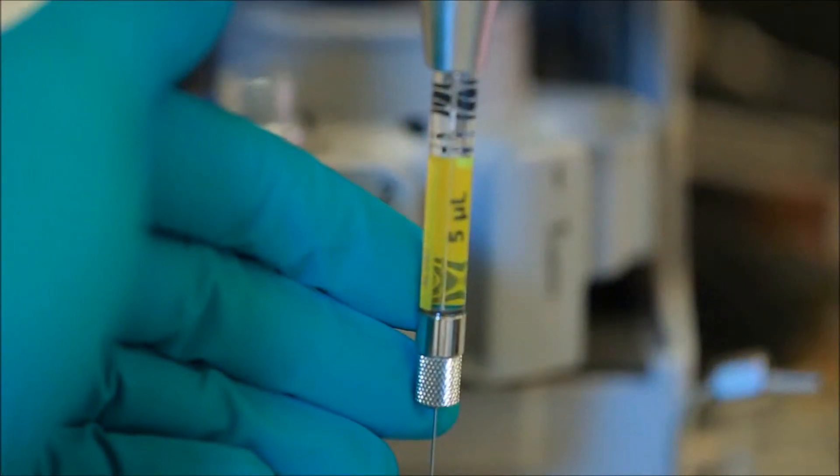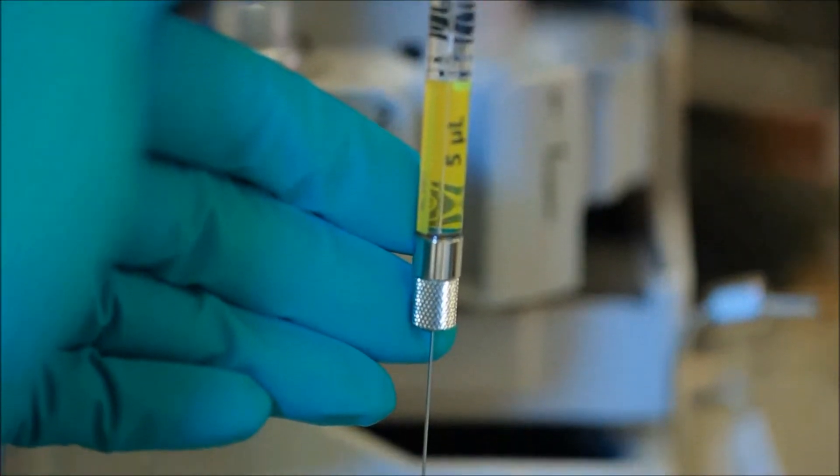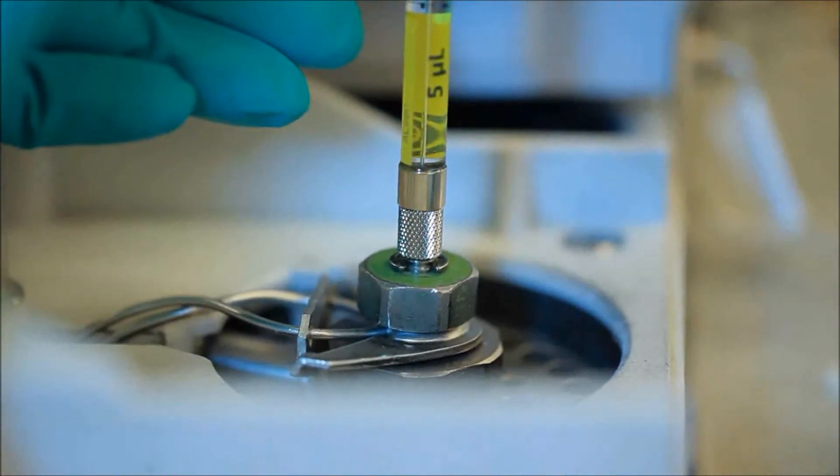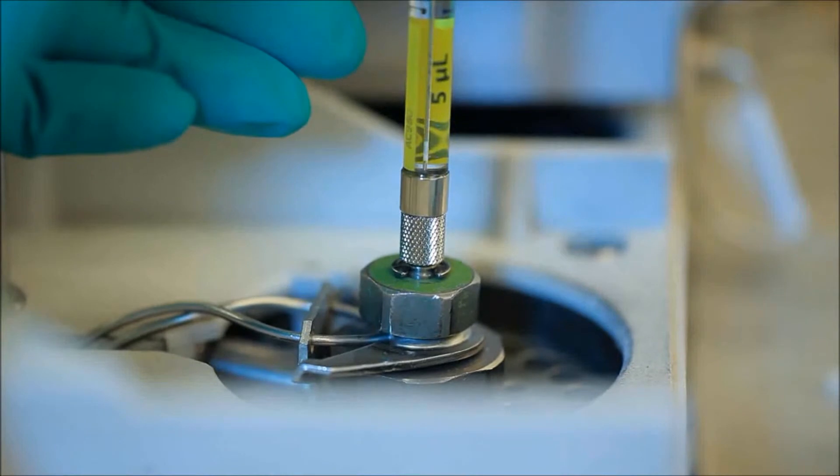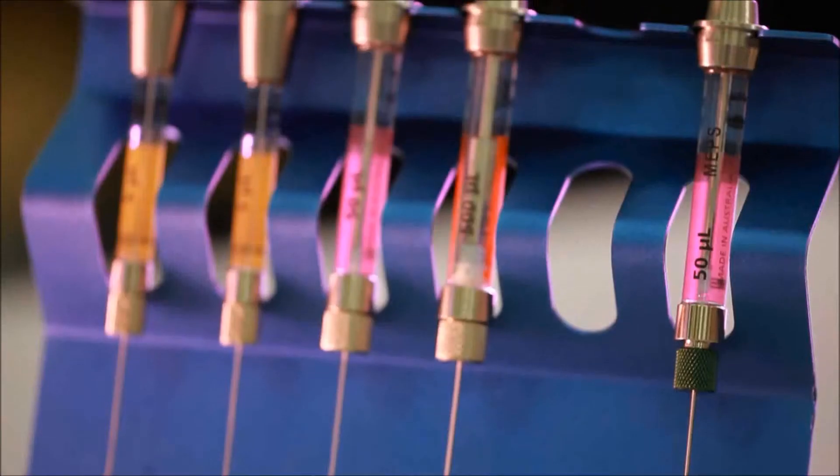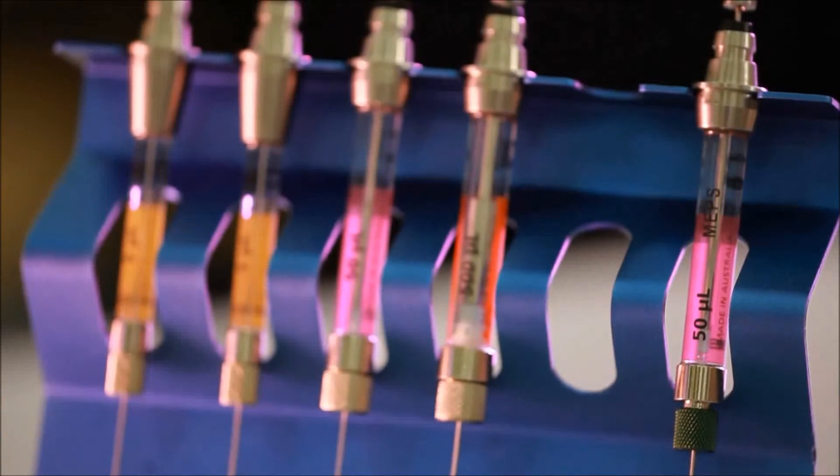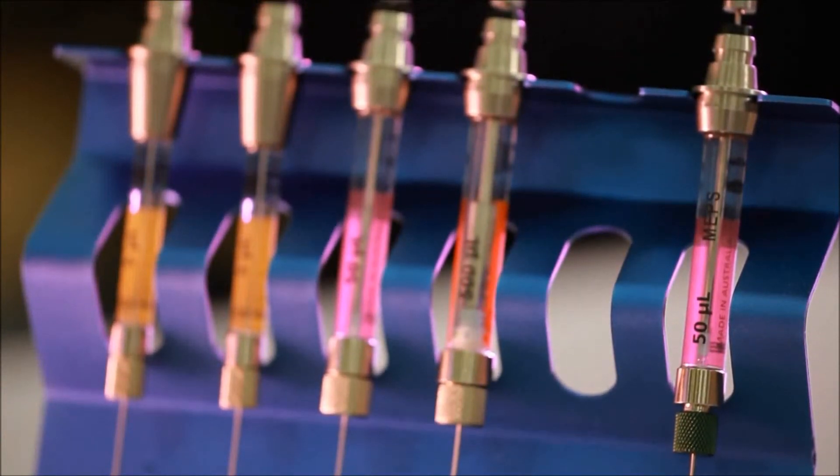For direct injection into chromatography instruments, there is no syringe on the market that can provide a more consistent volume and flow rate. EVOL's design makes it uniquely suited to the task. In addition, the stainless steel needles with which every EVOL is equipped also allow injection directly through SEPTA.